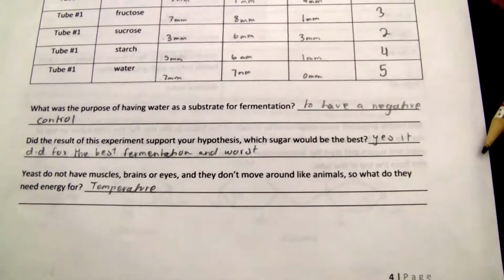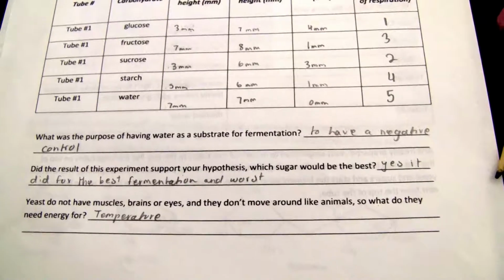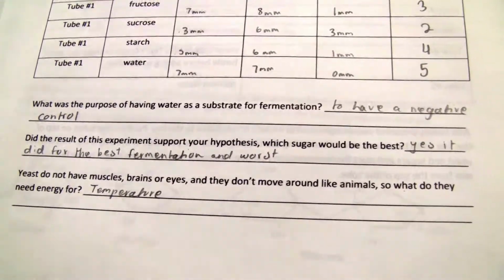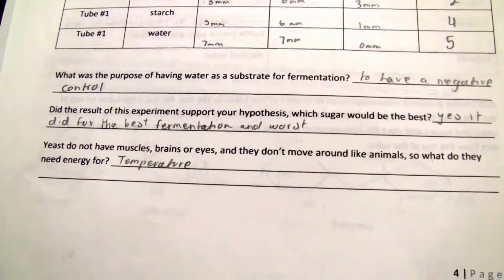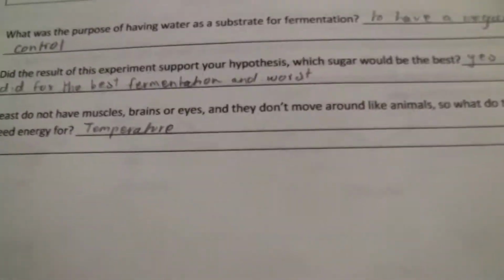What was the purpose of having water as a substrate for fermentation, as a negative control? Did the result of this experiment support your hypothesis? And which sugar would be the best? Yes, it did. We had glucose as the best one and the water as the worst. Yeast do not have muscles, brains, or eyes, and they don't move around like animals. So what do they need for energy and temperature? So this was our cellular respiration lab, which I've already cleaned up.